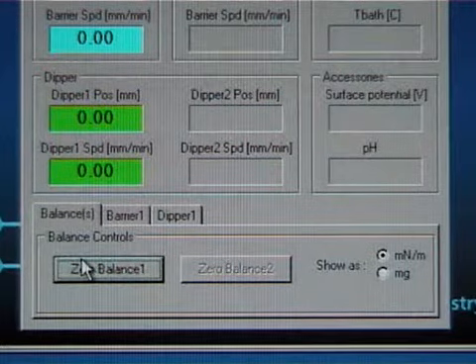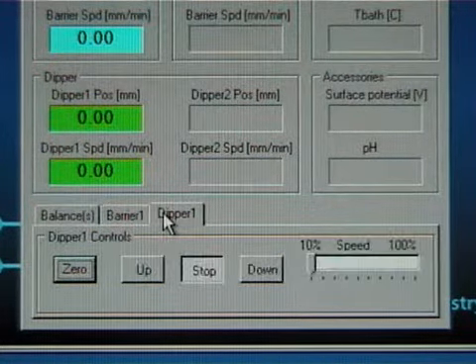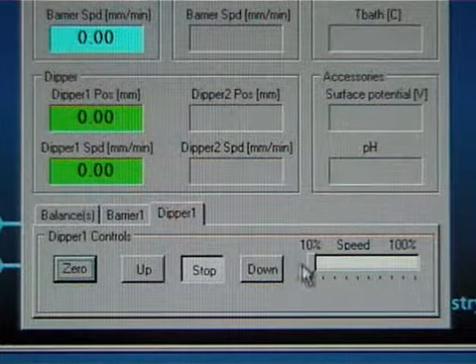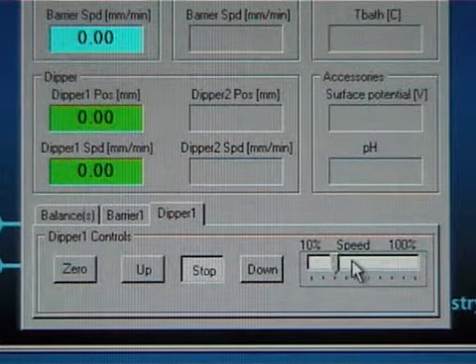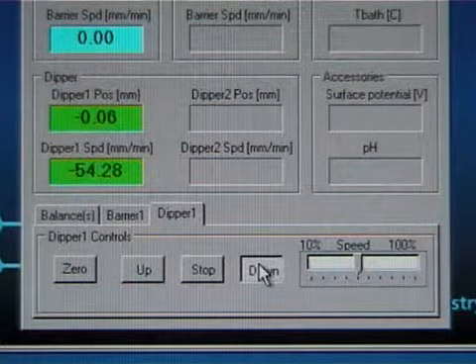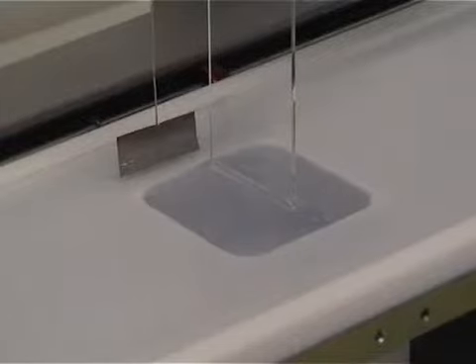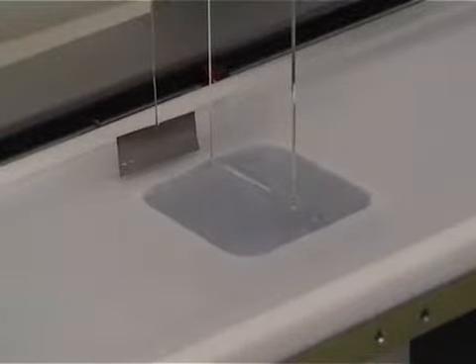Depending on the sample, either lower it to the desired depth or lift it so that it doesn't touch the surface. In this case, the sample is hydrophilic and dipping measurement is started under the subphase. After that, lower the sample to desired depth.